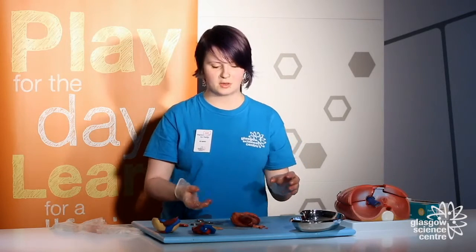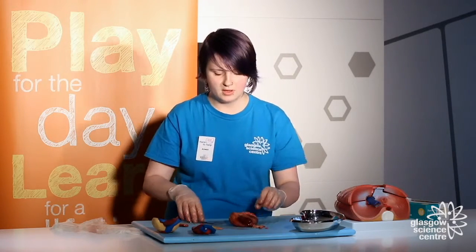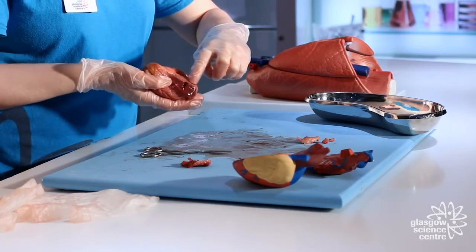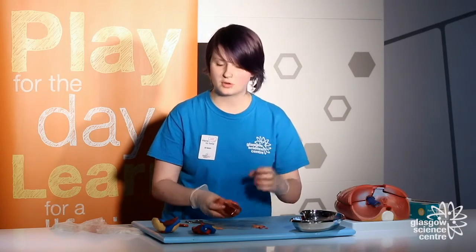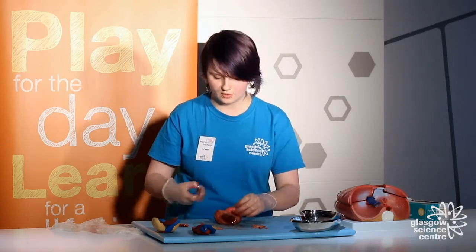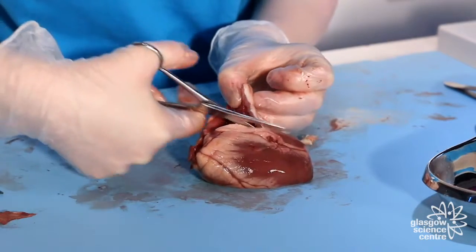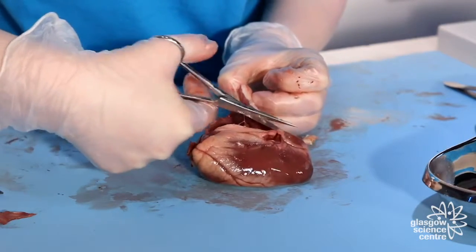So we've been in the right atrium and we're now moving to the right ventricle. If you see this line here — if you're doing it yourself you can use this line to cut down — this is just where fat is coating some of the arteries of the heart. We're going to slice down here and see what structures we can see on the inside.